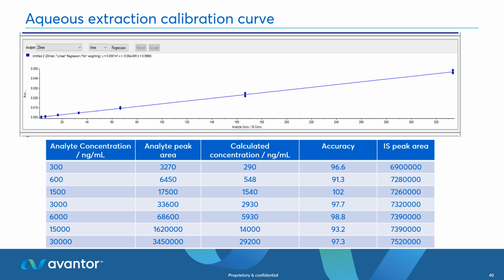There is still more work to be done, but certainly we've demonstrated that the conditioning, the re-equilibration, and the loading stages in terms of the chemistry, and then the final elution stage give us highly accurate and precise data for this thymidine 20-mer.